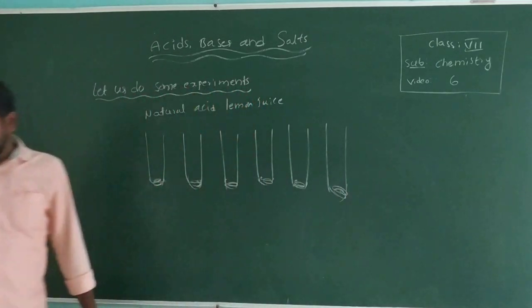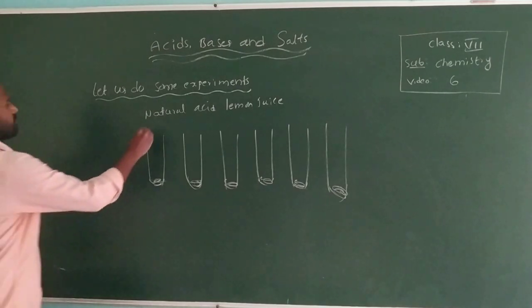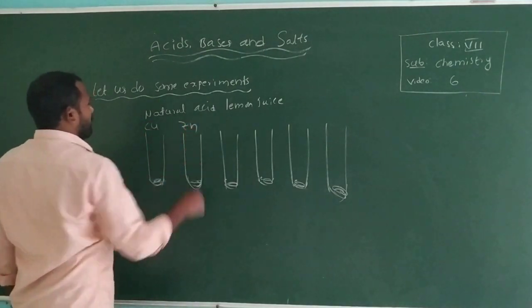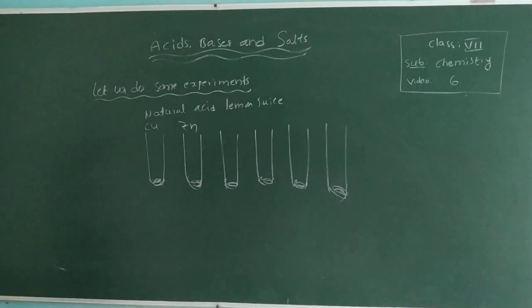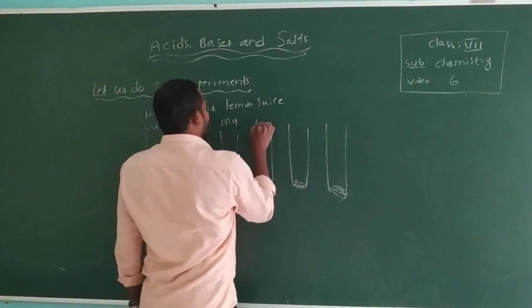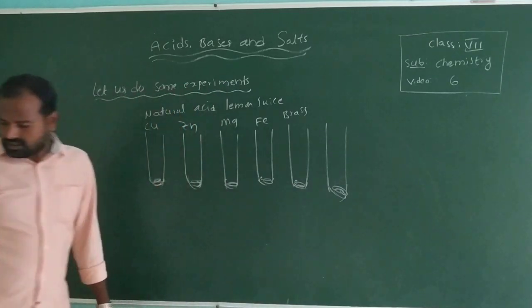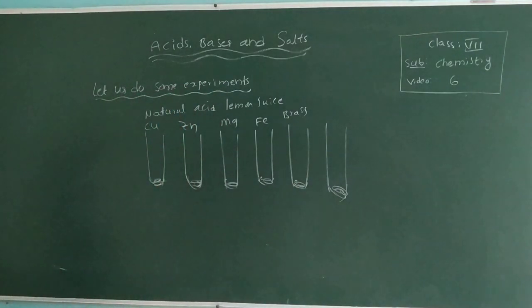And we are adding copper, zinc, magnesium, iron, brass, aluminum pieces into each of the test tubes.